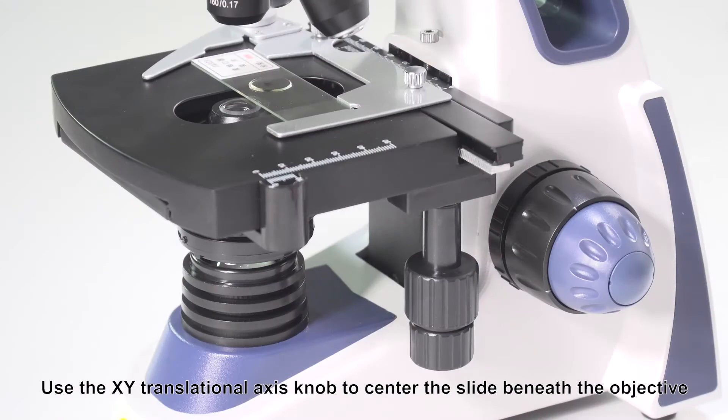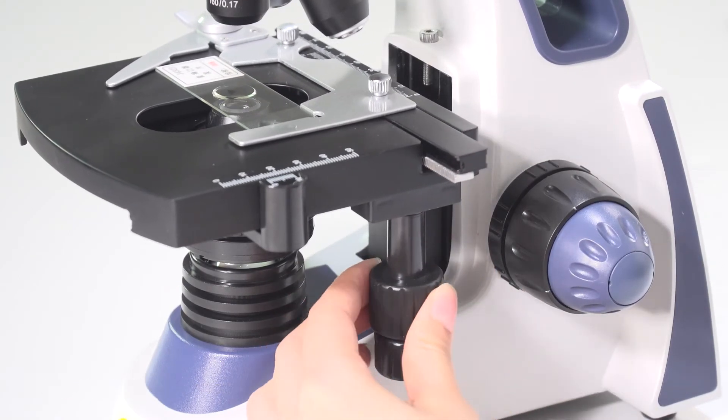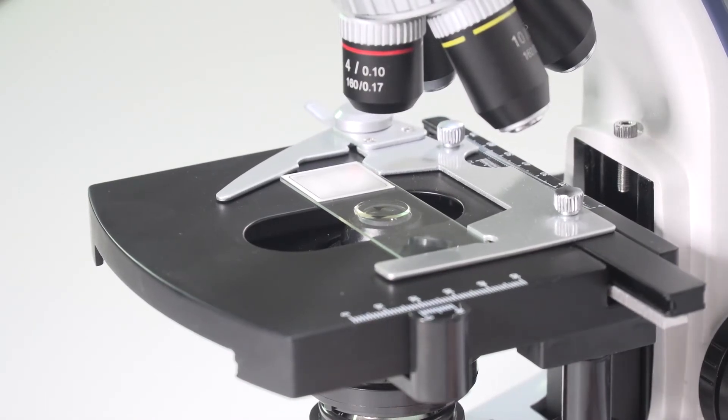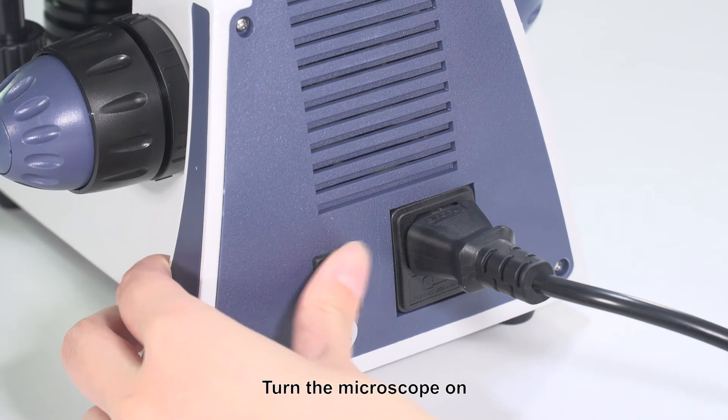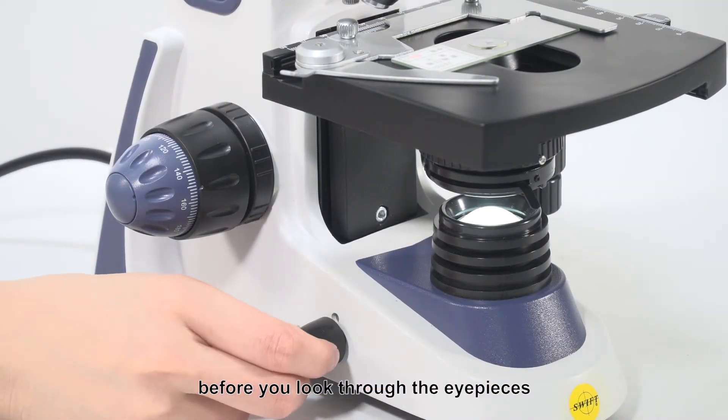Use the XY translational axis knob to center the slide beneath the objective. Turn the microscope on and set the bulb to the lowest illumination setting before you look through the eyepieces.